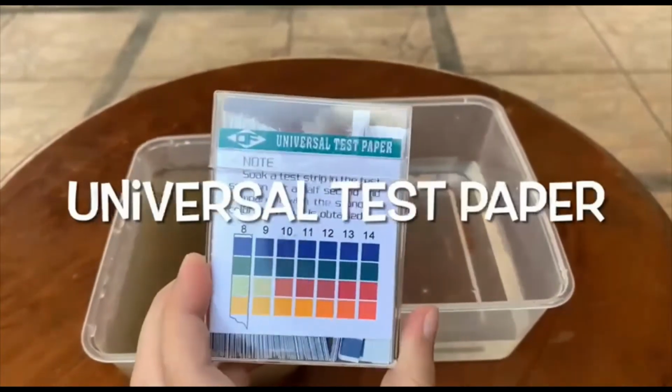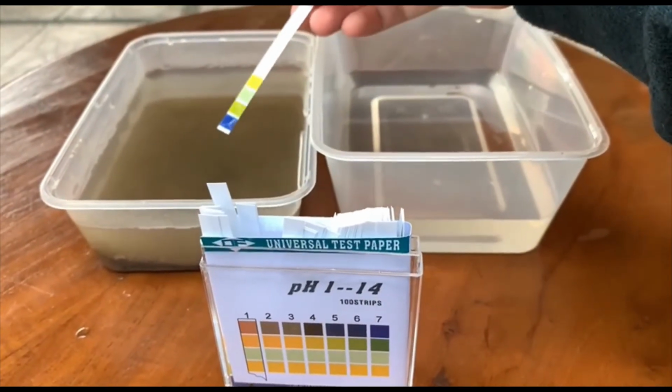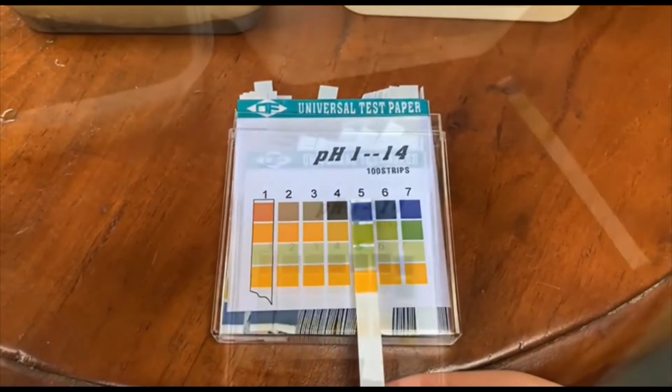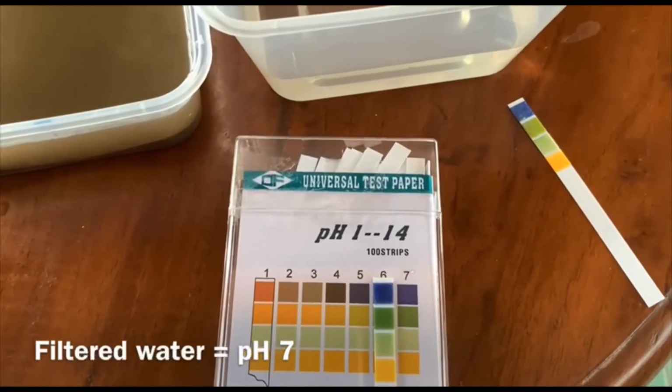Other than that, I'm using universal test paper to measure the pH value of the water. Soak the test strip into the water. The pH value for the unfiltered water is 6, which is categorized as slightly acidic. And the pH value for the filtered water is 7, which is neutral.